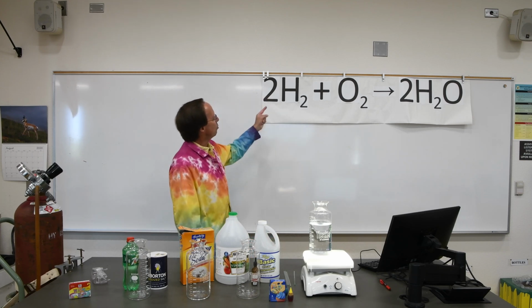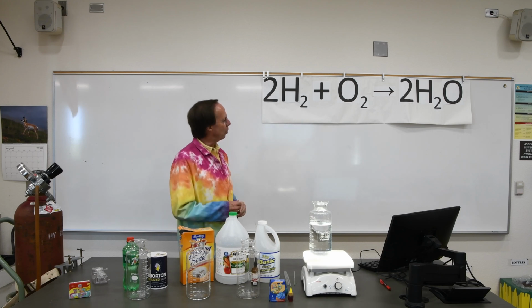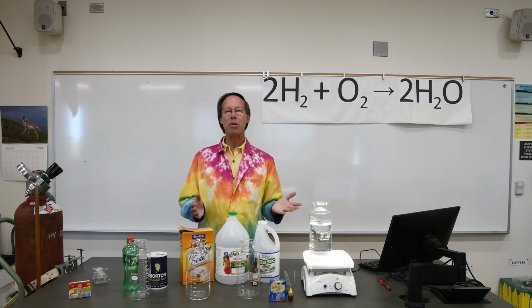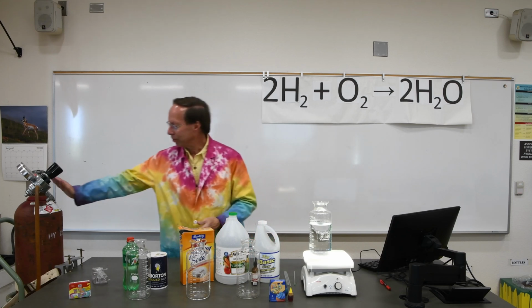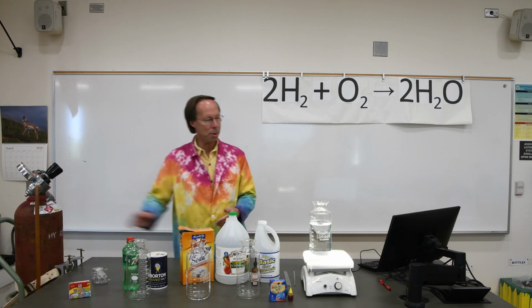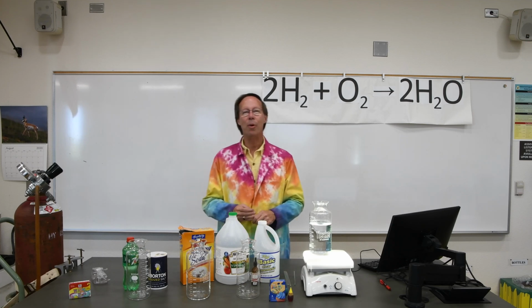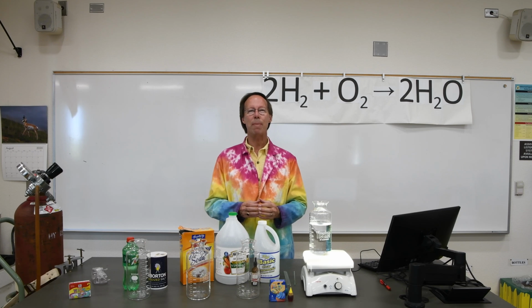This is one of the first chemical reactions we're going to talk about during chapter 4. And I have a very fun demonstration involving that chemical reaction and this little tank of hydrogen gas over here. We're going to be blowing some hydrogen up here in a little while once we get farther into the chapter.